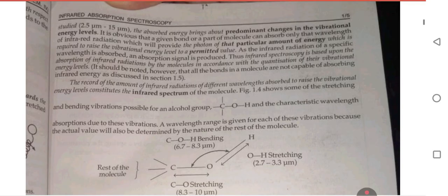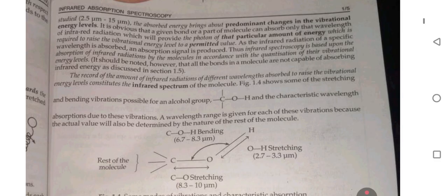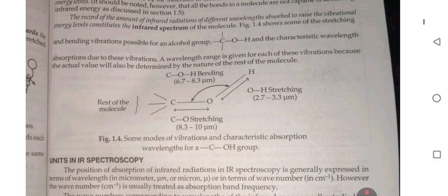Some of the stretching and bending vibrations possible for an alcohol group and the characteristic wavelength absorption due to these vibrations. A wavelength range is given for each of these vibrations because the actual value will also be determined by the nature of the rest of the molecule.